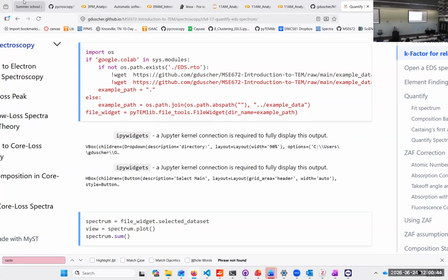Local composition can be, as I said, so most of the samples, relative sample thickness can be quite illuminating. So if you have something that you know directly next to it and the compositions, then you can actually infer the composition, the thickness quite accurately, right? Or you calibrate the inelastic mean-free path for your spectrometer conditions, which means your effective collection angle.